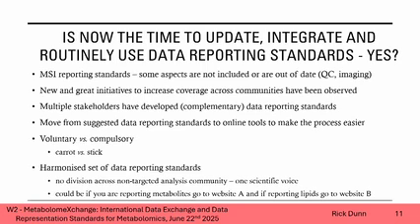And we've seen really, for example, the MSI standards are 17, 18 years old now, and they are not used routinely. So there's been a sort of carrot within the community. It's probably not working, so there needs to be more of a stick approach that we see in other omics. When you're submitting data to any proteomics journal, you have to submit your data, and maybe that's the way that we need to go within the metabolomics community.